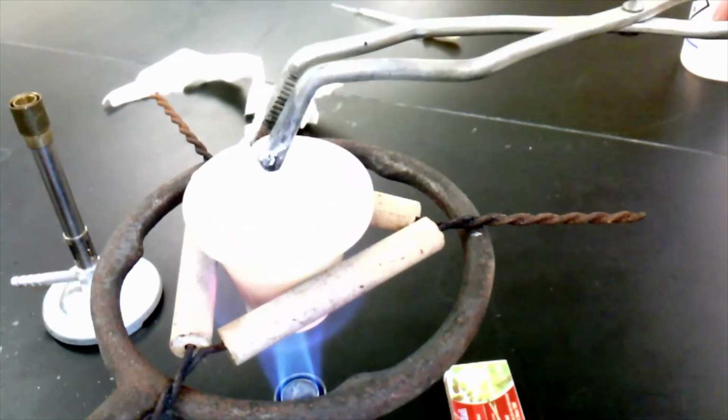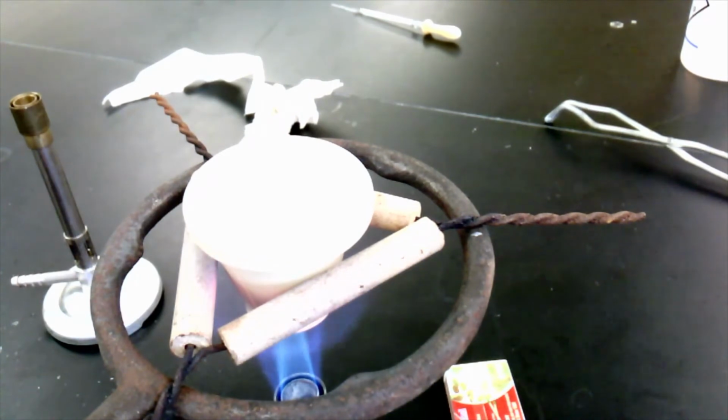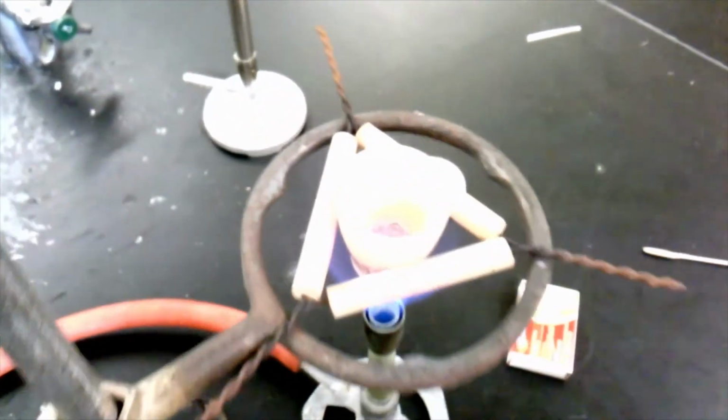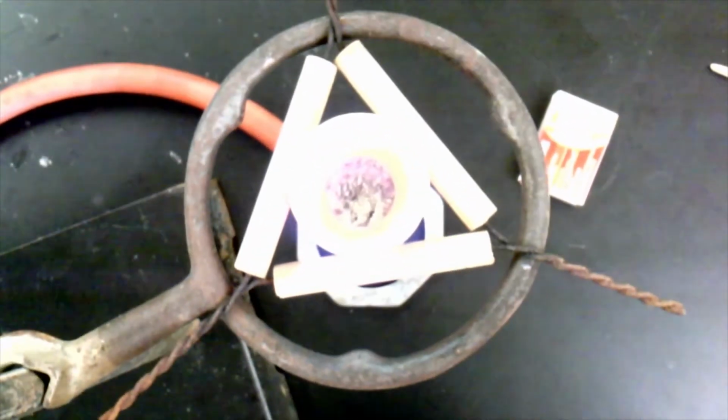So we're going to just let this heat strongly. I'll come back in a minute once this is done reacting, and I'll talk about how we're going to get rid of that magnesium nitride so that we're sure the only product we have is magnesium oxide. We are now at the point where it's not really burning anymore when I have the lid off. So let's try to show this without ruining my webcam. It's kind of glowing red at the bottom. It's kind of hard to see.